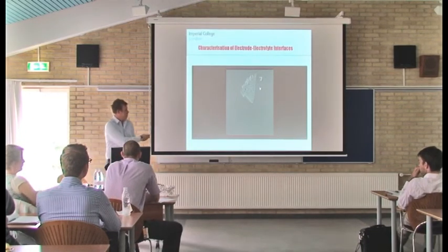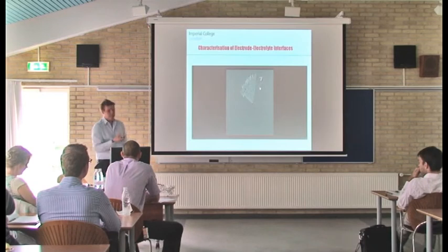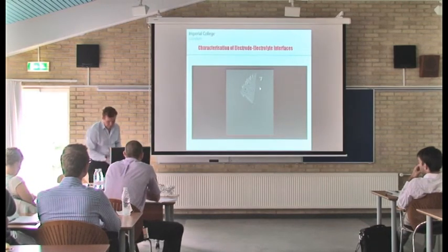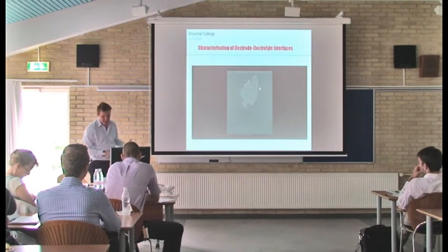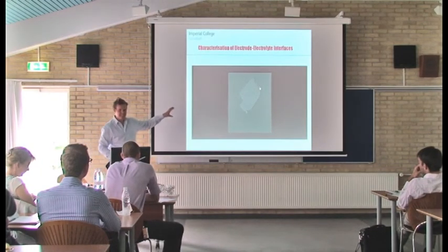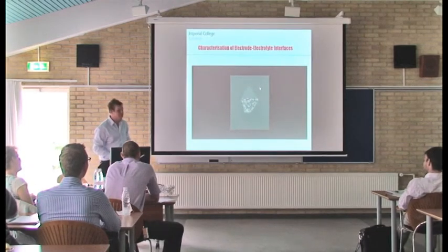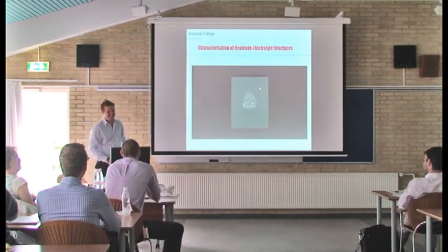And obviously, one advantage of the CT technique over the FIB technique is that you don't get the same streaking, you don't get differential milling rates and these types of things. So it's quite nice to be able to capture that in detail. And we were really surprised about just how many defects there were in this electrolyte. It sort of made me think about switching suppliers.